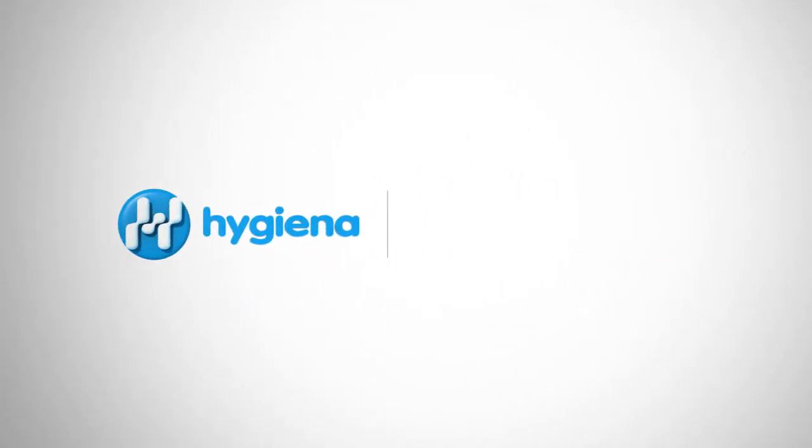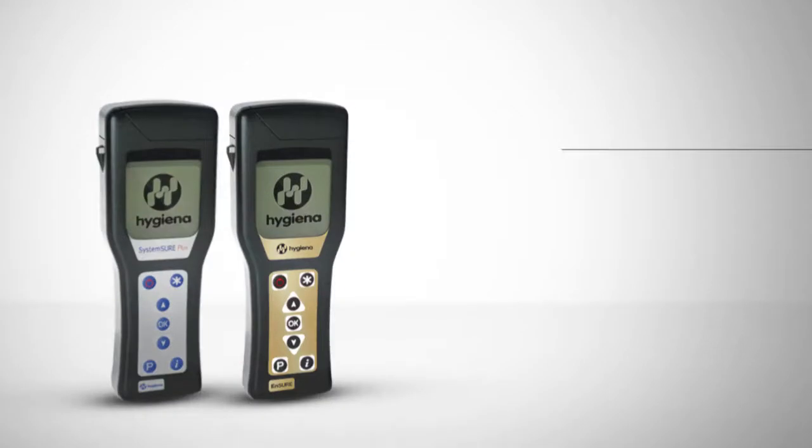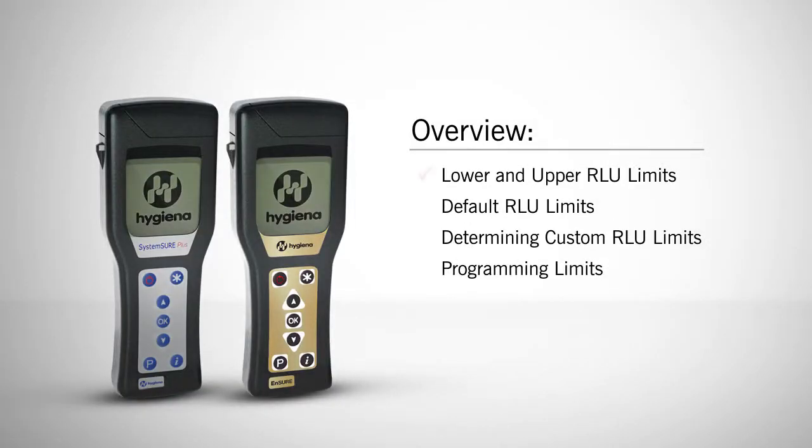Welcome to the Ensure and Systemsure Plus tutorial for setting ATP pass-fail limits for the food and beverage industries. In this video, we will cover lower and upper RLU limits, default limits on your systems, how to determine custom limits, and how to program those limits. Let's get started. The first section is lower and upper RLU limits.